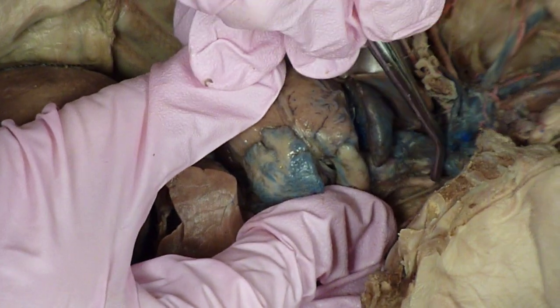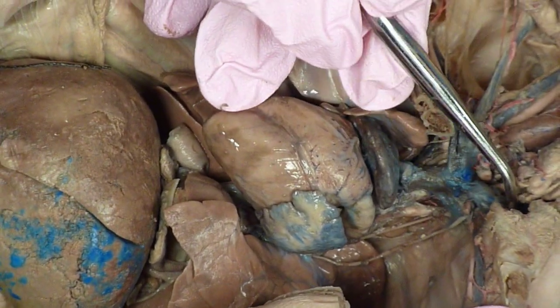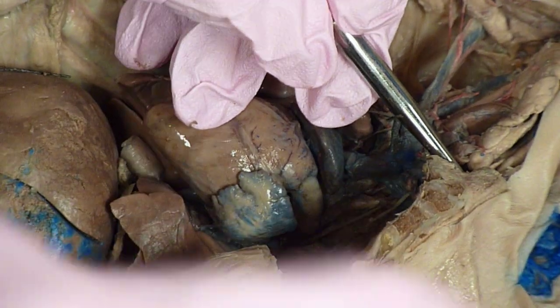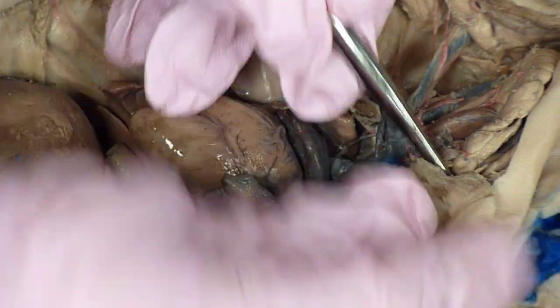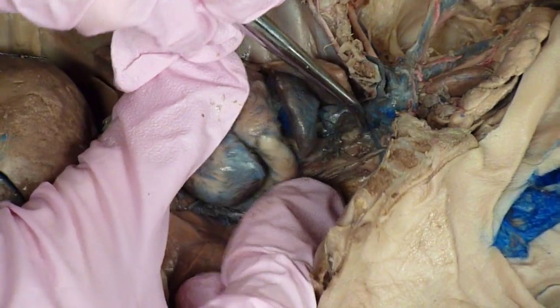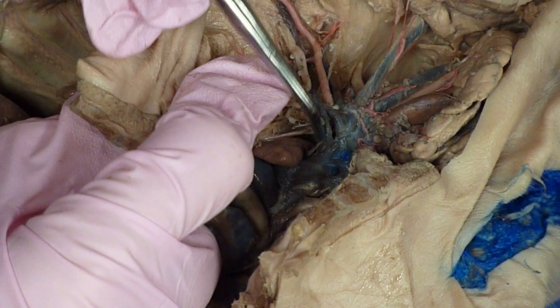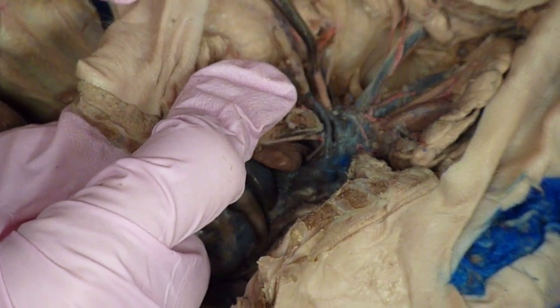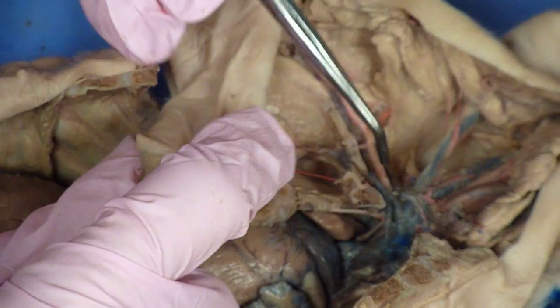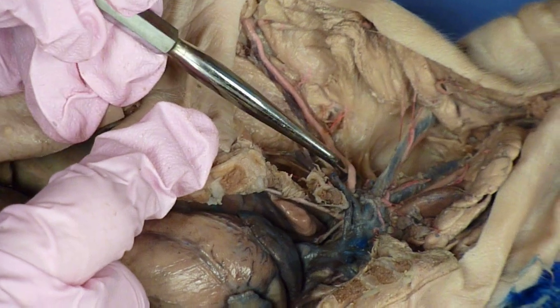Follow the left subclavian up — it's kind of hard to see here, but it would go past the ribs. Once it goes past the ribs, it becomes the axillary artery. Here we're following the brachiocephalic up — that other branch to the right of the left subclavian — and if you follow that up, it actually becomes the right subclavian, which comes this way. Once the right subclavian passes through the ribs — here's the ribs — once you get to this side of the ribs, it's the axillary.